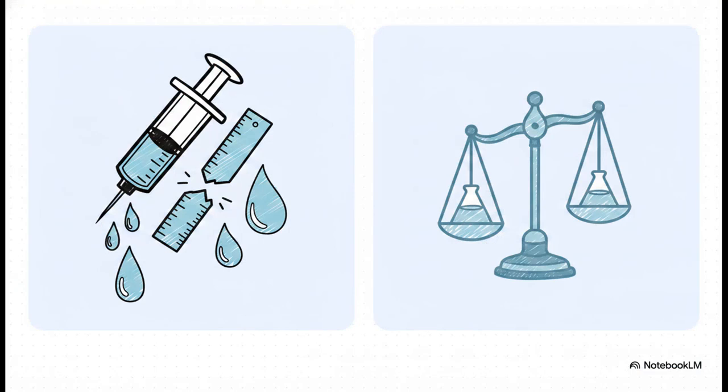Normally, you might just reach for the external standard method. But here is the villain of our story. It heavily relies on knowing the exact, precise volume of the injected sample. It completely depends on the mechanical perfection of your injector loop or your syringe. And honestly, if that syringe is off by even a microscopic fraction between your standard run and your sample run, your quantification is totally compromised. That's exactly where the internal standard method swoops in to save the day. It completely bypasses that vulnerability by compensating for those physical imprecisions using brilliant relative response ratios.